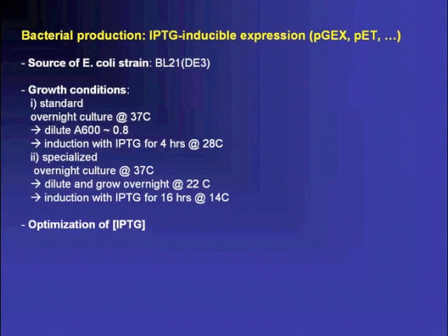Okay, I'm going to read this question. TAT cleavage site peptide without any tags are expressed. Would the TAT sequence help the expressed peptide to penetrate the bacterial cell wall so that we can purify the peptide from the media itself? Did you get all of that? That's quite a long question. Then probably I would go with secretory sequences, secretory signals that you put there. I think it's a good thing. On the other hand, if it's secreted by the bacteria, you grow them in quite large volumes, so it would require quite some concentration. But I'm not saying it's not possible. It's in fact a good idea.